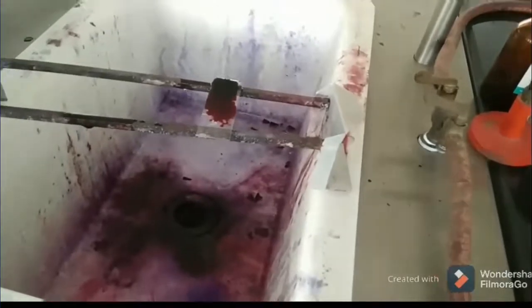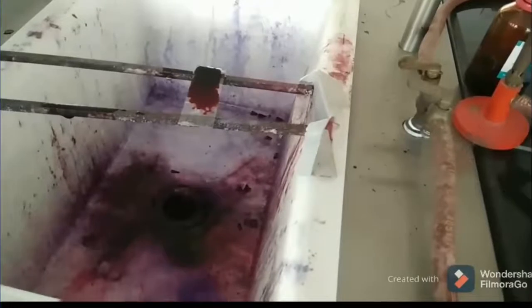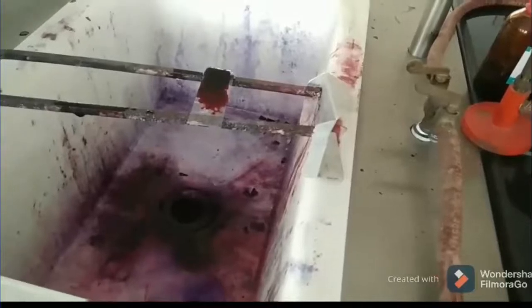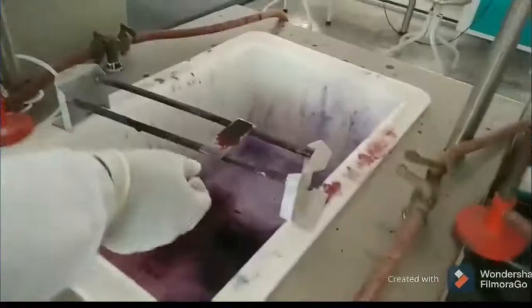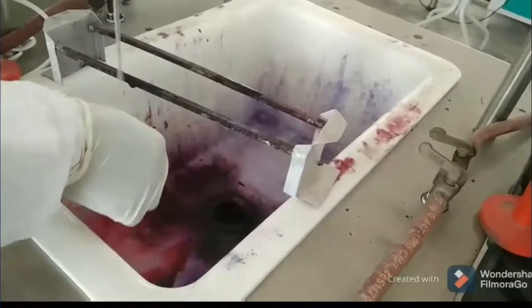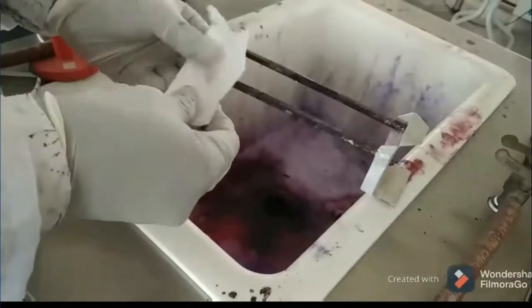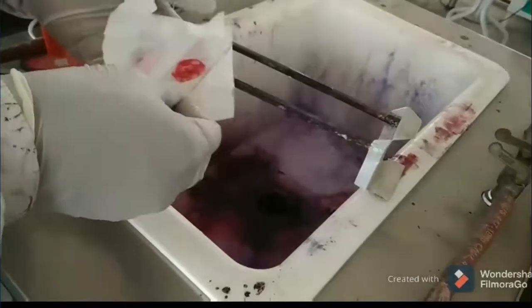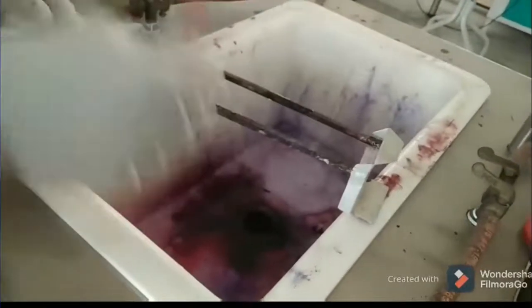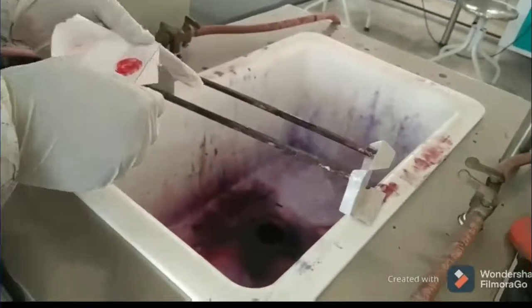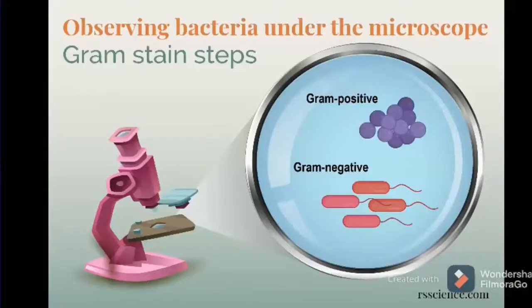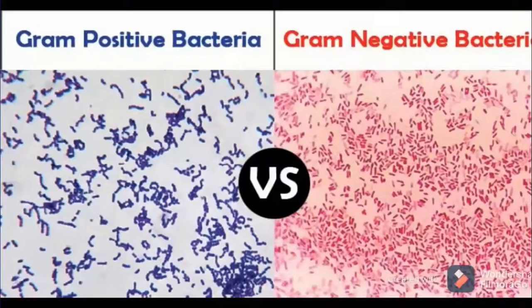The fourth step is safranin, the counter stain. Pour it so it covers the smear and wait for one minute. Safranin is pink in color. Gram negative bacteria — those other than gram positive — will take up the safranin and retain the pink color. So gram positive will appear violet, and gram negative will appear pink.